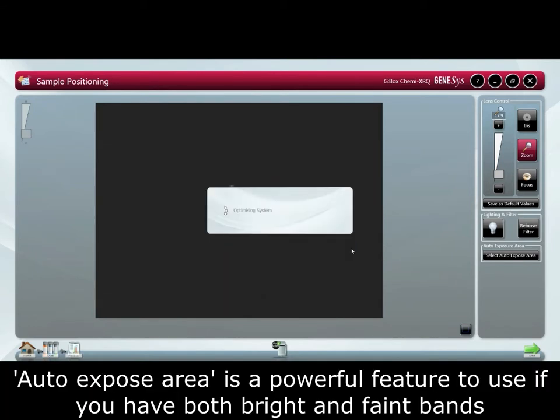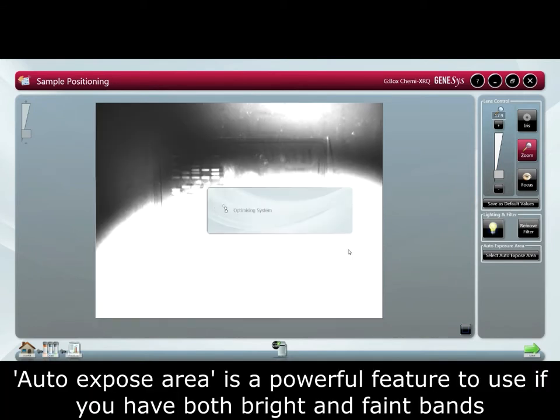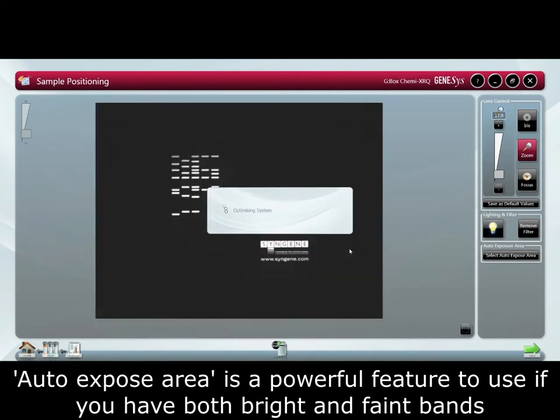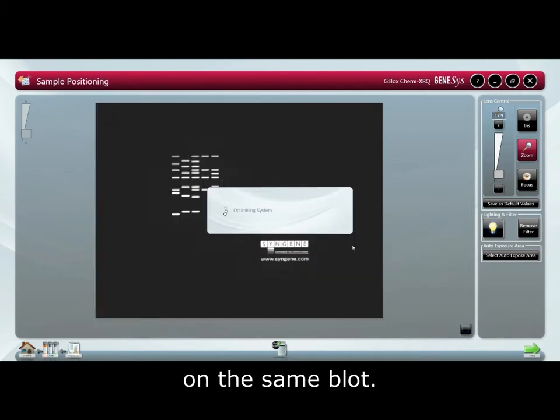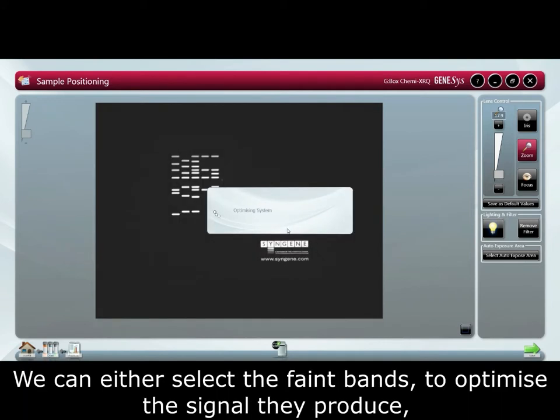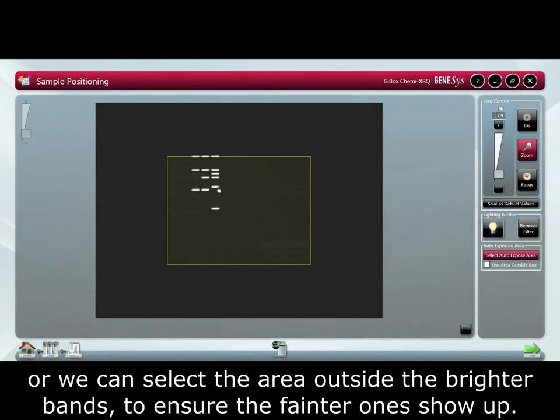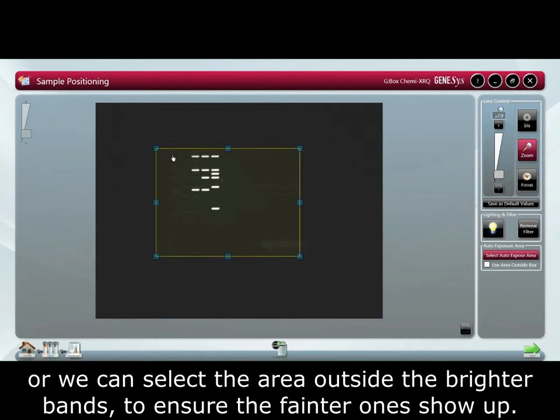Auto expose area is a powerful feature to use if you have both bright and faint bands on the same blot. We can either select the faint bands to optimize the signal they produce, or we can select the area outside the brighter bands to ensure the faded ones show up.